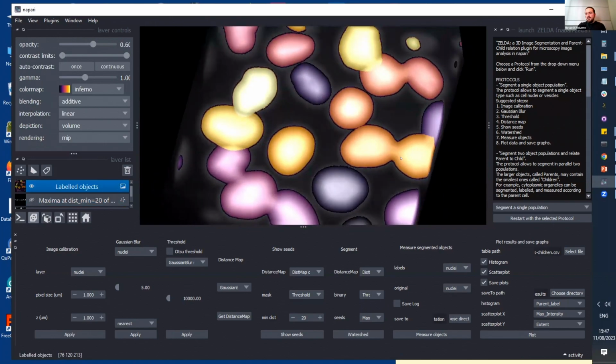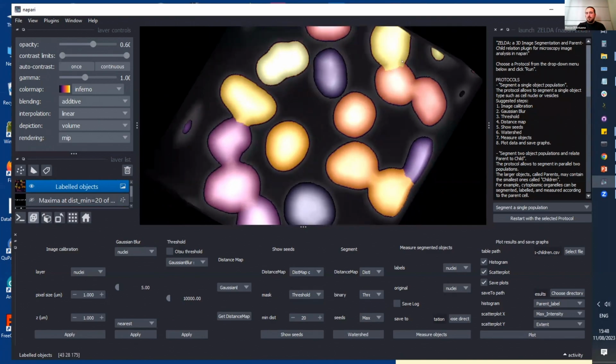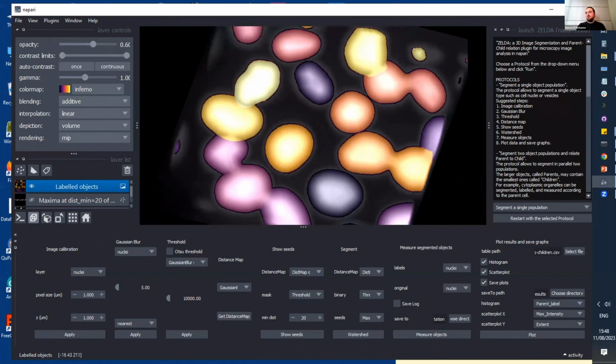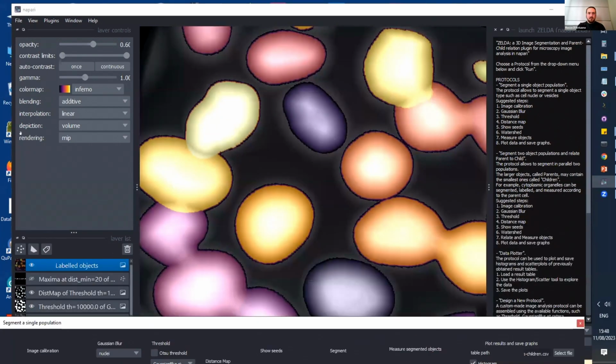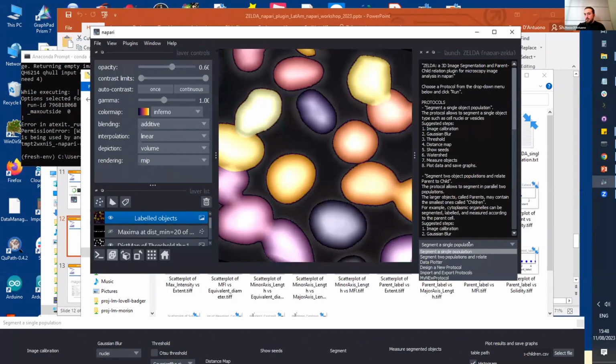And now imagine that of these cells, you want to exclude the small objects. So what I'll try to do is open the widget that filters by area. Area is also a measurement of size, even if the data set is in 3D, because we look at the number of pixels. I will open that widget and try to exclude these small objects. So I put this panel in float mode, so I have more space. I'm sorry, I'm running on a laptop, and I will try to load my new protocol.